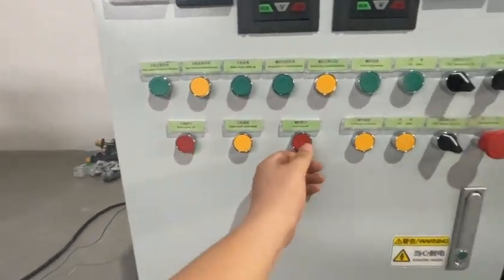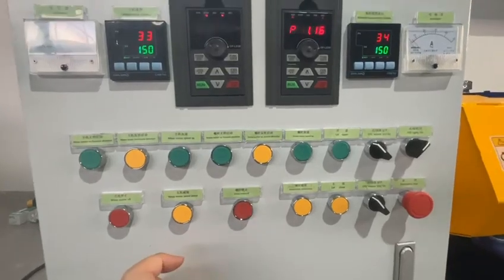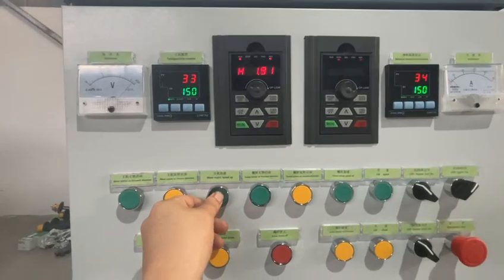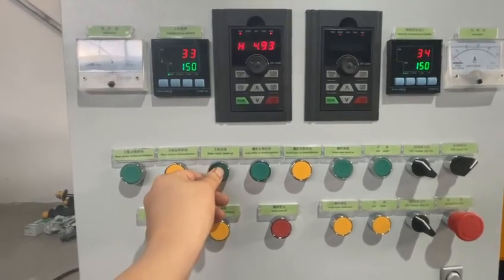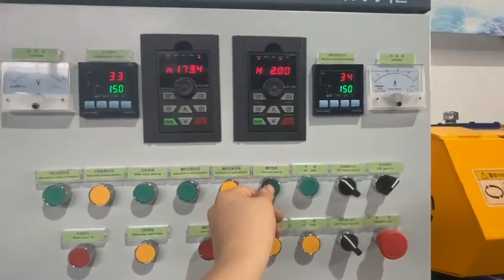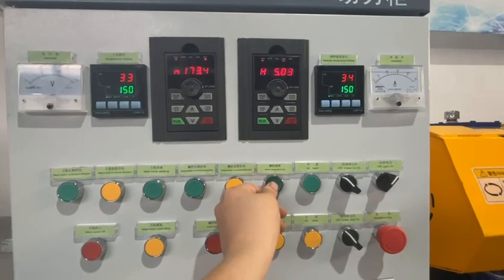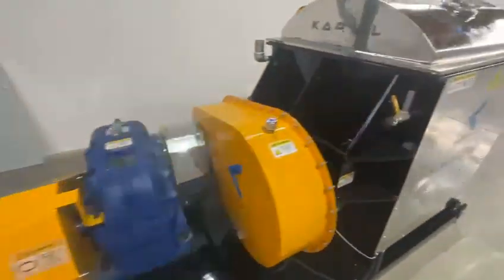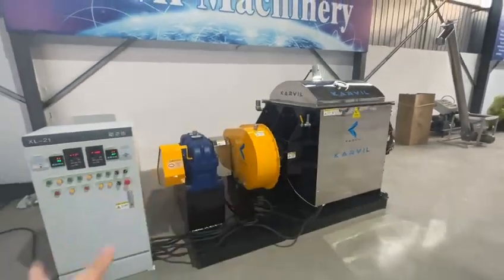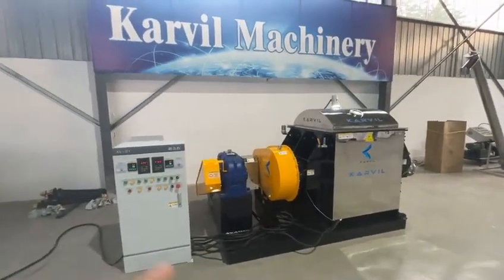Now we stop the screw. We test the reverse direction — double Sigma blade reverse, some speed, and the screw reverse, some speed. Now the double Sigma blades are rotating in the reverse direction. During the mixing period, the screw reverse rotating direction can help to mix the material more evenly.